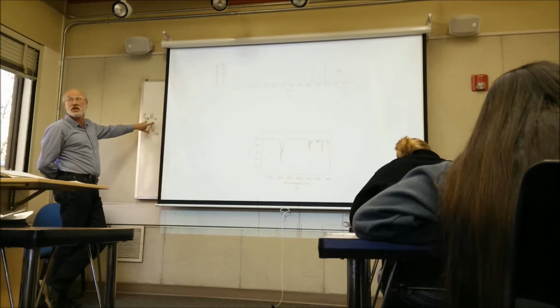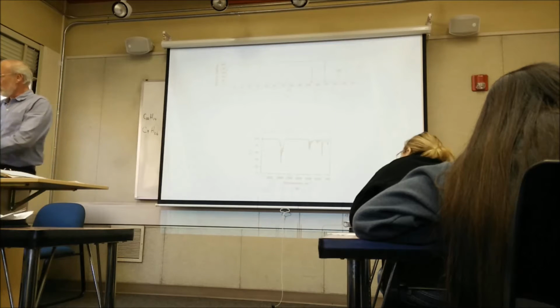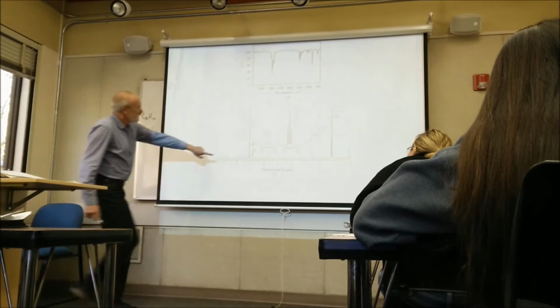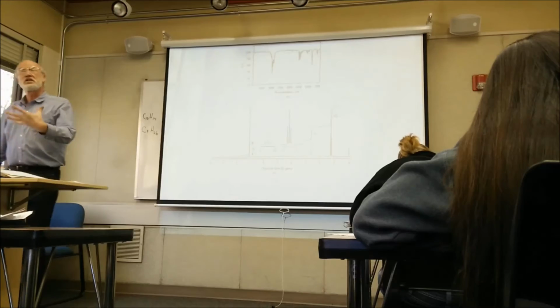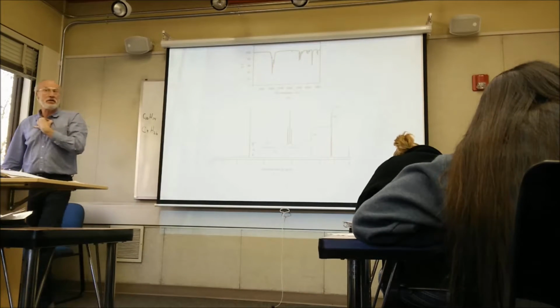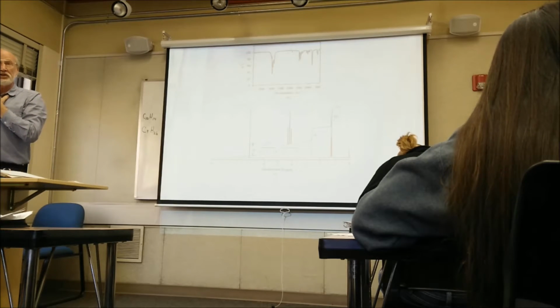The first thing you guess is, let's see if it's a benzene ring. There's a 700-ish peak. So we'll go to the NMR, and sure enough, right at 7, so this is another benzene ring. That's 6 carbons. So it's a benzene ring with 4 additional carbons.